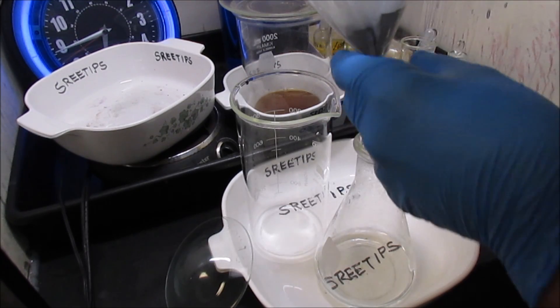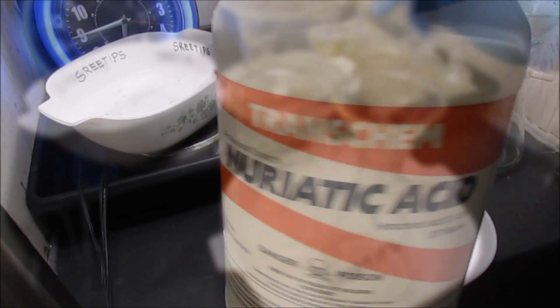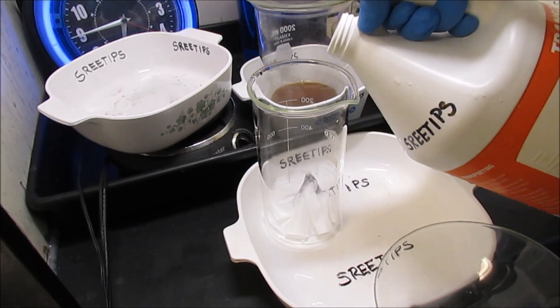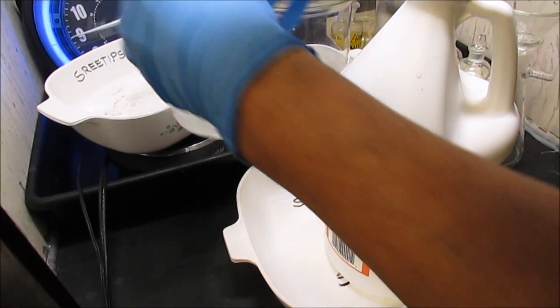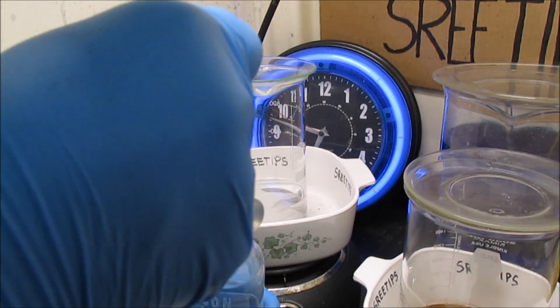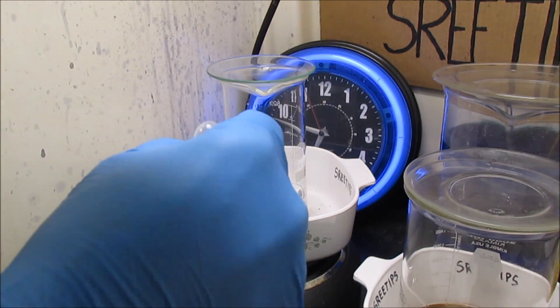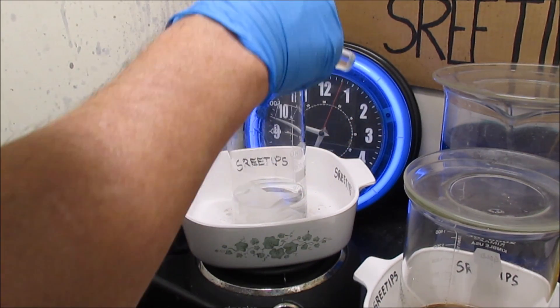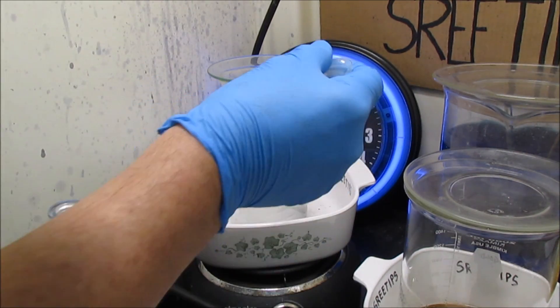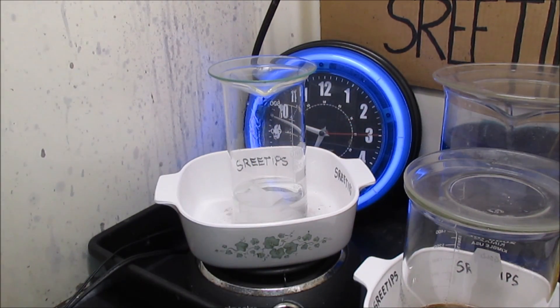I'm going to transfer the contents of the funnel back into the beaker and dissolve this again. I'll add a couple hundred ml of hydrochloric acid and put it on the heat. Now I'll start dosing the mixture with nitric acid: 3ml, 6ml, 9ml, 12ml — I'll hold off right there. There's 12ml of concentrated nitric acid in there now.